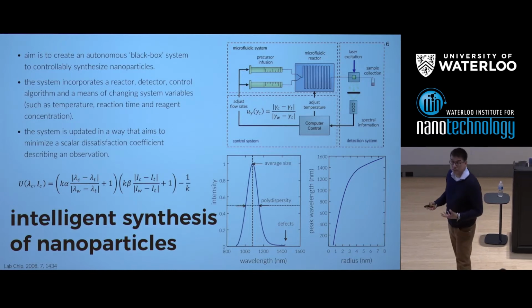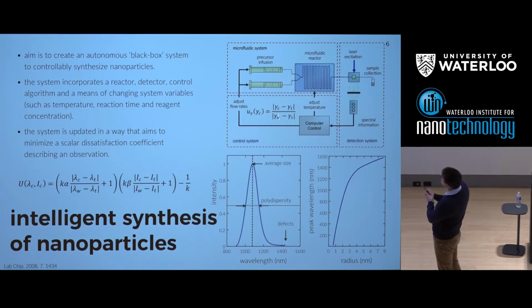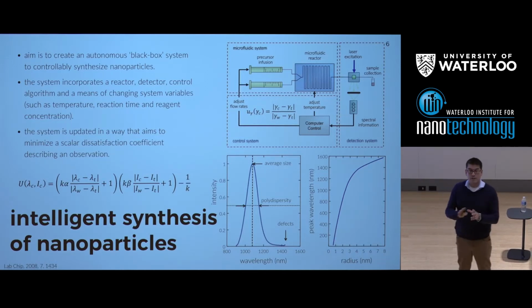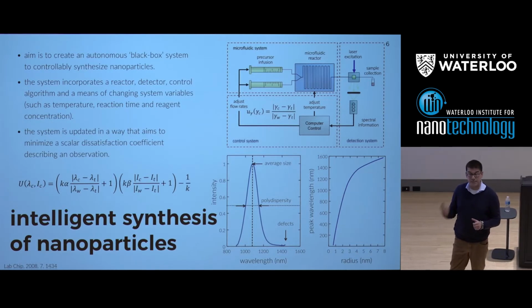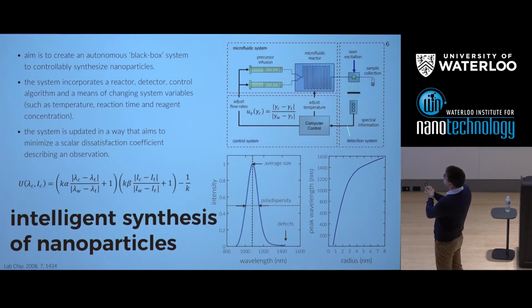In more contemporary work, which I'll show you later, it is simply capillary tubing. We have between 2 and 4 inputs, and we're going to rely on our microfluidic reactor to do the chemistry well. But importantly, once we've made our nanoparticles, they're going to exit the device, and then we're going to use this detection system to work out what we've made.